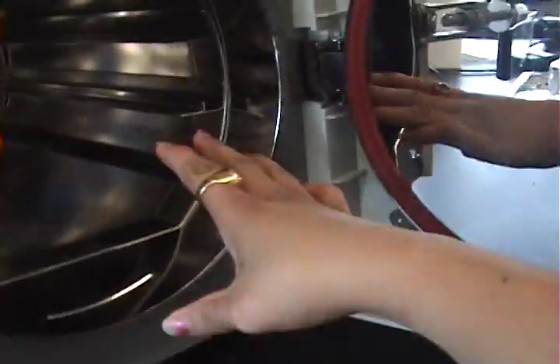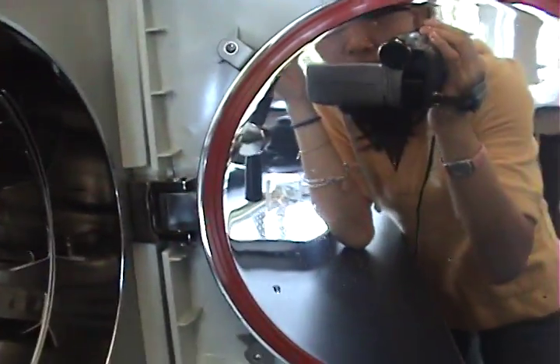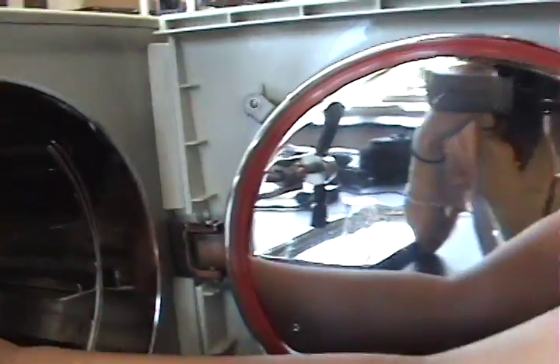Put the tray on a heat-resistant counter. The inside of the autoclave will still be hot, so do not clean it right away. Once it has cooled, you can clean it with a paper towel — just wipe down the front and the inside.